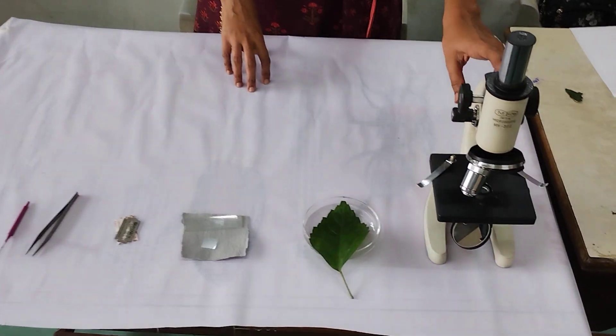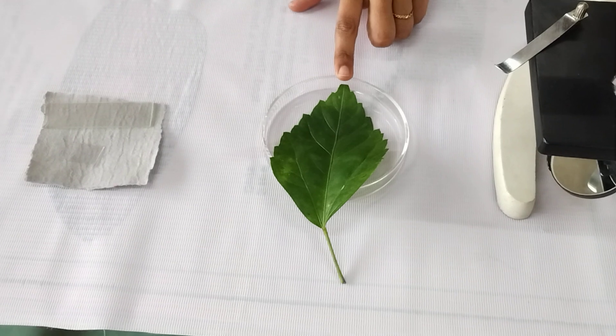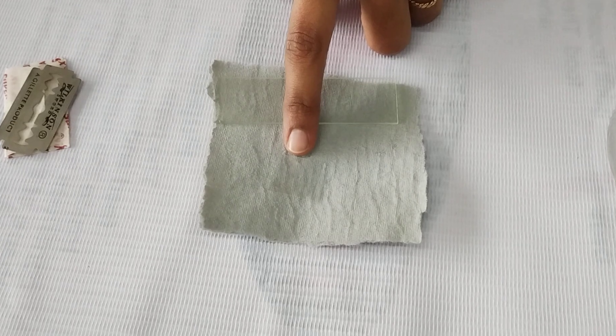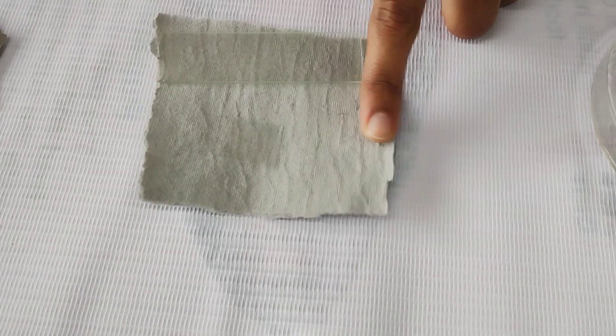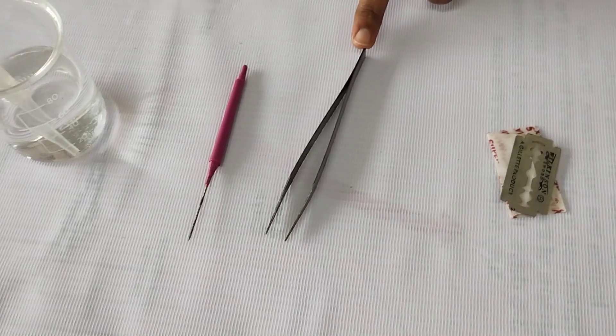Requirements are one compound microscope, one dichot leaf (hibiscus leaf), one slide, one cover slip, filter paper, new blade, forceps, needle, and distilled water.